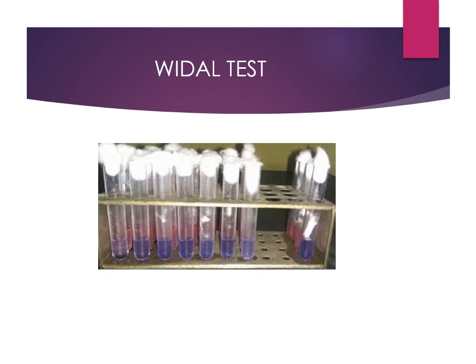Whereas the H antigen is specific. So if it is typhi, you put one row of TH, and two rows for paratyphi A and paratyphi B. So any of these, and then you take the patient sample, add the antigen, and put it in the water bath.